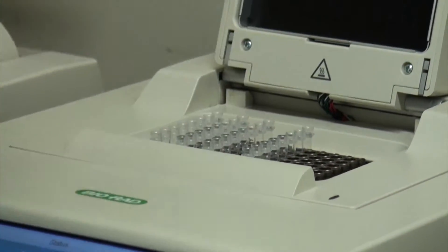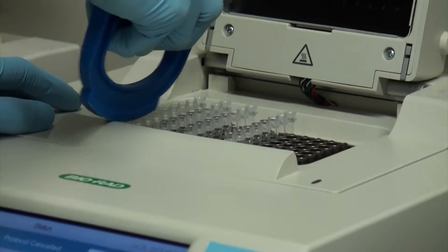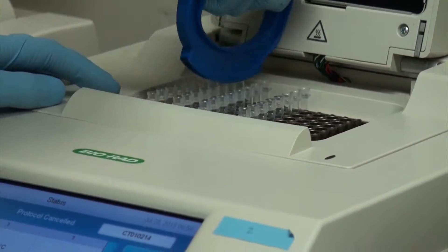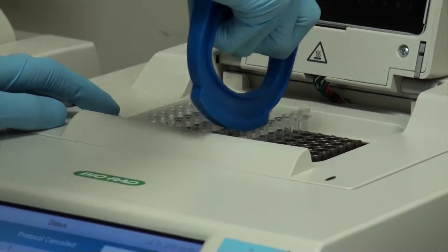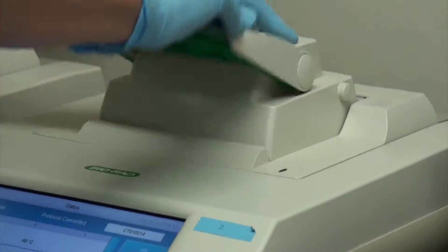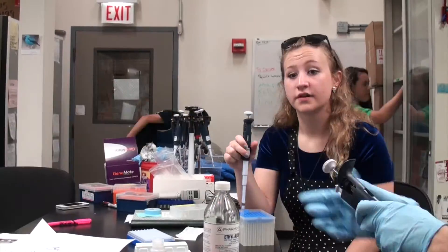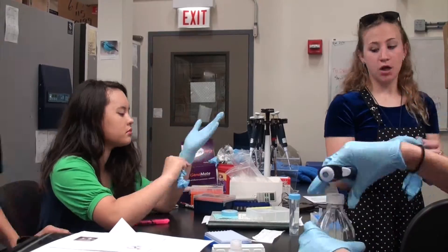After we take it out, we have to clean the product before we can do anything else. This cleaning involves the use of EDTA, ethanol, and water. This just helps remove all the leftover from ExoSAP, PCR, and cycle sequencing, so that the precipitate we get at the end is strictly the fragments of DNA that we want to be sequenced and nothing left over that could be a contaminant.